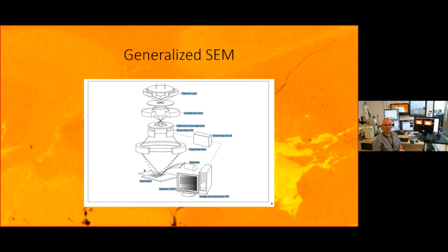Electrons are negatively charged, so in a magnetic field, we can focus those beams. So we use a couple of lenses coming down the column to focus that beam to a point where the sample is. We want a very fine point where the beam impinges on the sample. And then we have scan coils, which is how we form an image, and I'll talk a bit about that more in a second. So that's basically the very common things.